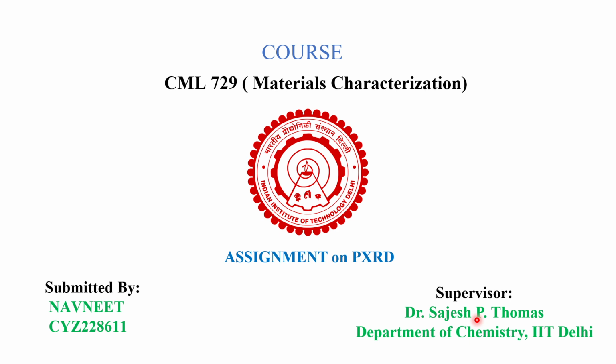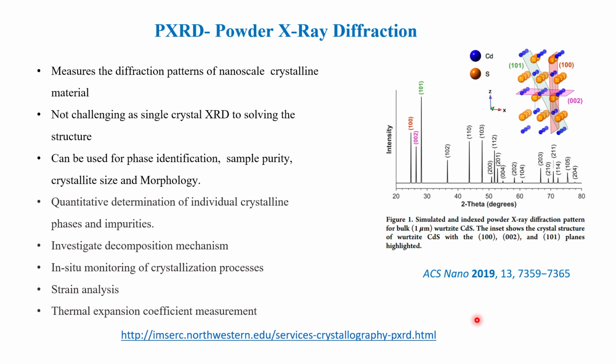Hello everyone, today I am going to discuss some fundamentals of powder XRD. The full name of powder XRD is powder X-ray diffraction. It basically measures the diffraction pattern of nanoscale crystalline material.